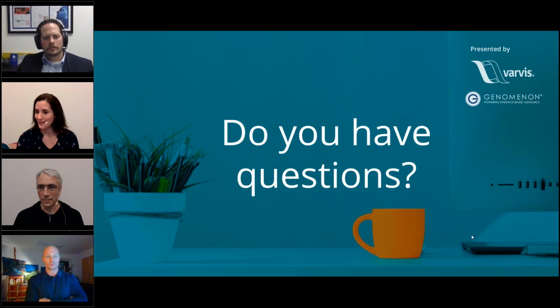Okay, the next question is for Ben. How often are annotation sources updated in Varvis? Well, generally this depends on the annotation source, of course. For example, ClinVar releases new data every month, and that's the interval at which the ClinVar data is updated in Varvis. So far, we have not had sources that update more frequently, but we would try to keep up with the evidence as it appears and as it is released.